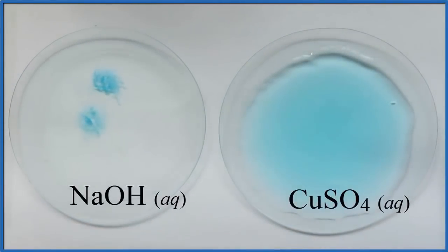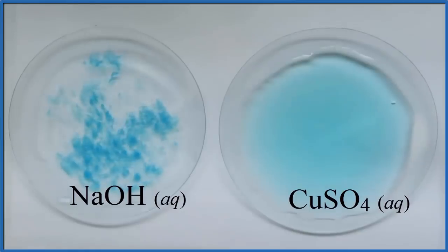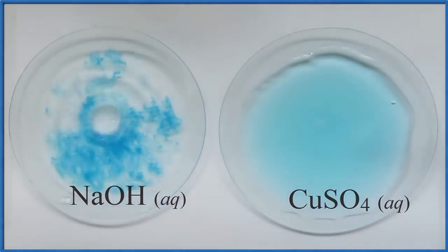Here we're taking some sodium hydroxide and we're dropping the copper sulfate right into it again. You can see on the right, CuSO4 is kind of a pale blue liquid, but when it's mixed with that sodium hydroxide, we get that blue precipitate.